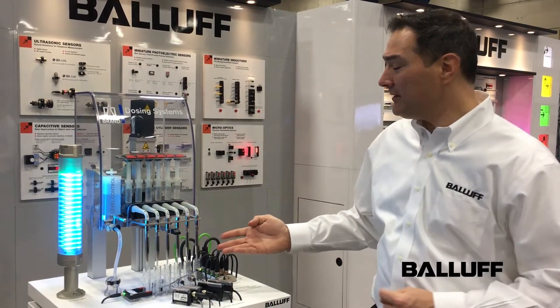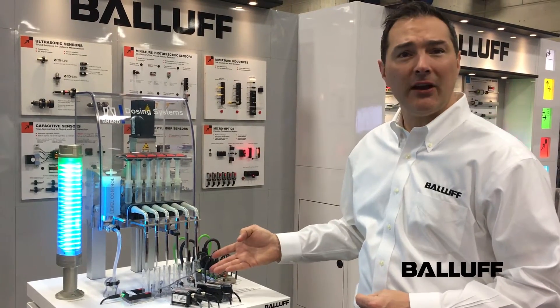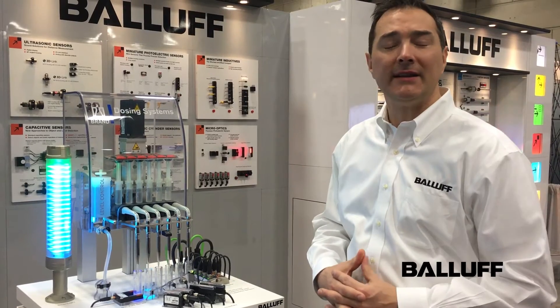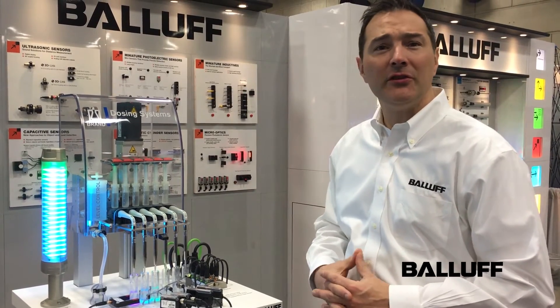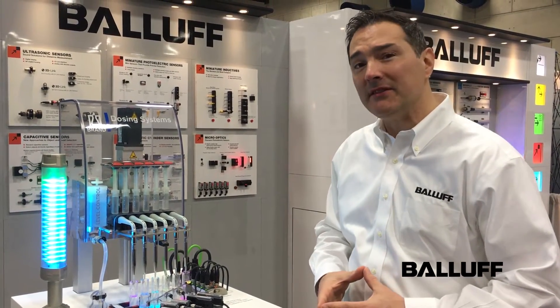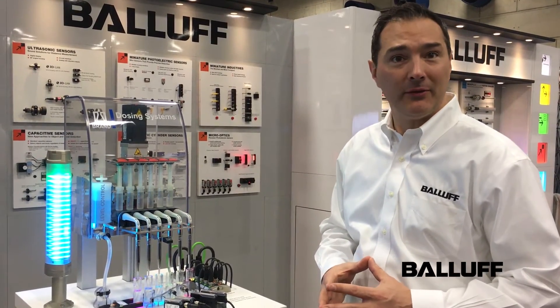At this display, we have six different sensor head technologies. Three of these are capacitive sensors, which are best suited for detecting liquid through a tank wall or a tube wall of different diameters, particularly suited for liquids that may foam or film. A capacitive sensor can ignore foaming or filming and still reliably detect liquid level.